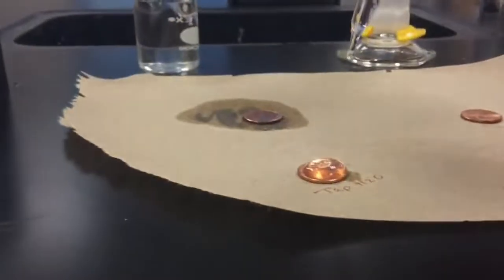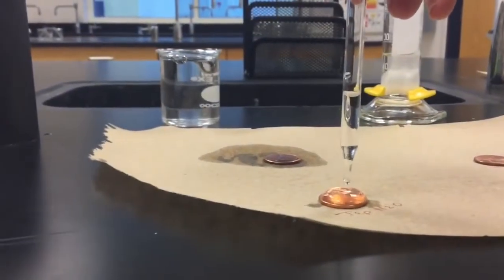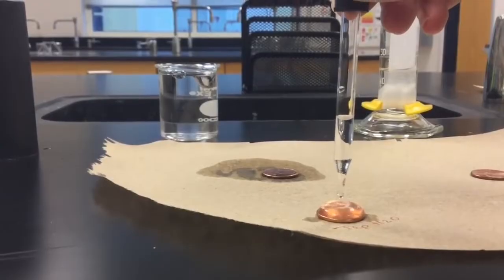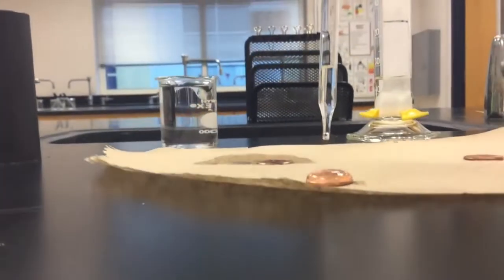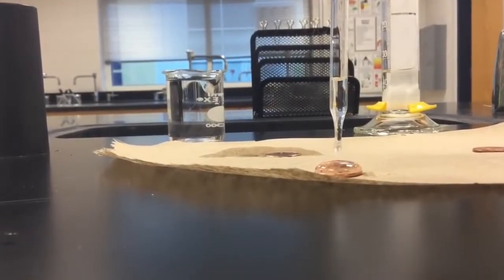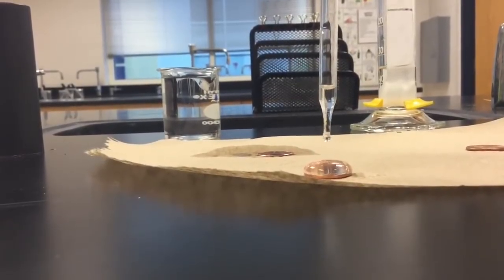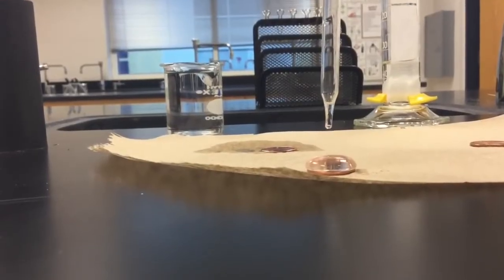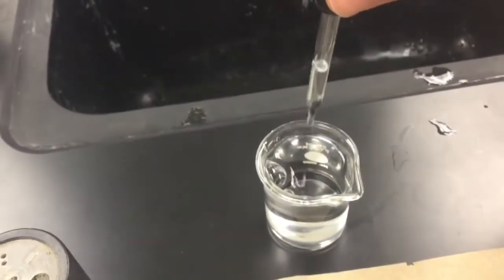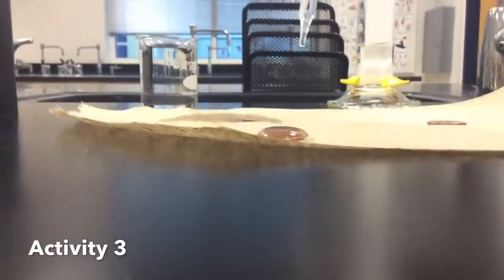Continuing the count: 14, 15, 16, 17, 18, 19, 20, 21, 22, 23 - take a look, you need to draw this. Continuing: 24, 25, 26, 27, 28, 29, 30, 31, 32, 33, 34. We're at 34, then 35 - and that's when it overflowed. So you can see what that looks like.